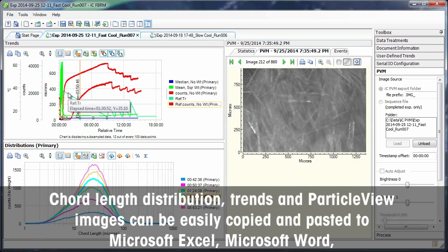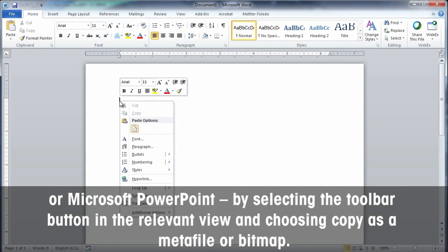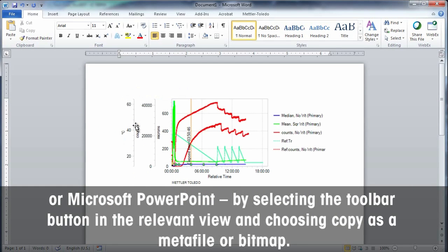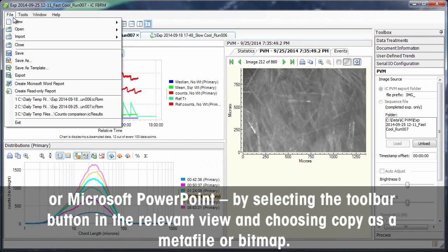Chord length distribution, trends and particle view images can be easily copied and pasted to Microsoft Excel, Microsoft Word or Microsoft PowerPoint by selecting the toolbar button in the relevant view and choosing copy as a meta file or bitmap.